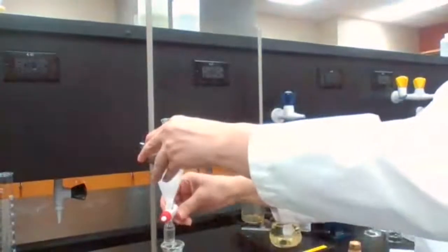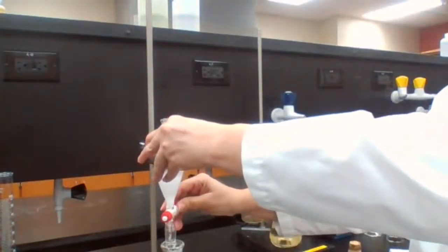Now I'm going to separate the bottom layer, try to get it out.